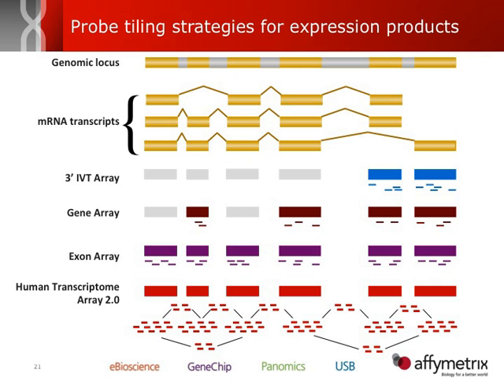events. In 2008 or so, we came out with our first generation of whole transcript arrays, which we termed the gene or the exon arrays, which I'm sure many of you are familiar with. So instead of just putting the probes at the 3' end of the gene, now we actually tile probes against each individual exon, across the entire transcript. So this is great. Now we can have more robust information at the gene level, and we can start to look at exon level information as well.